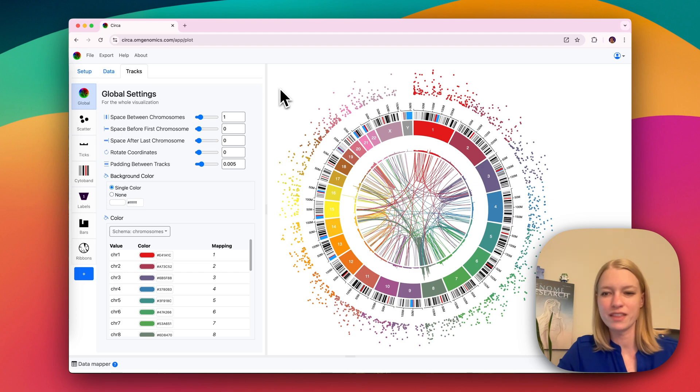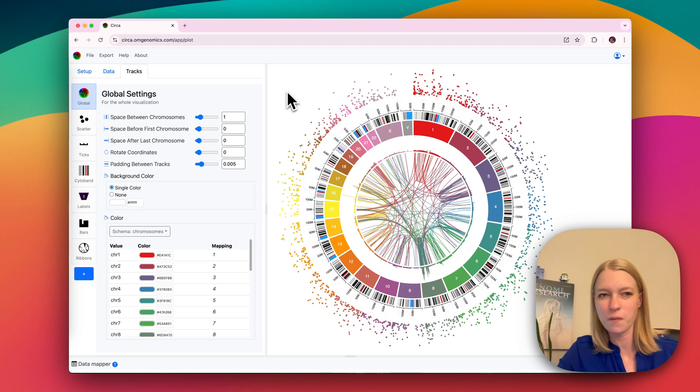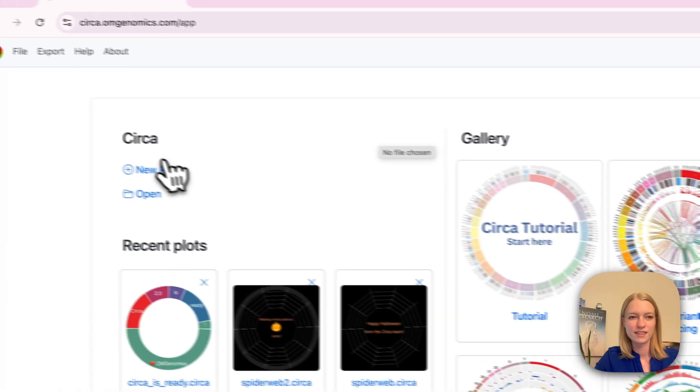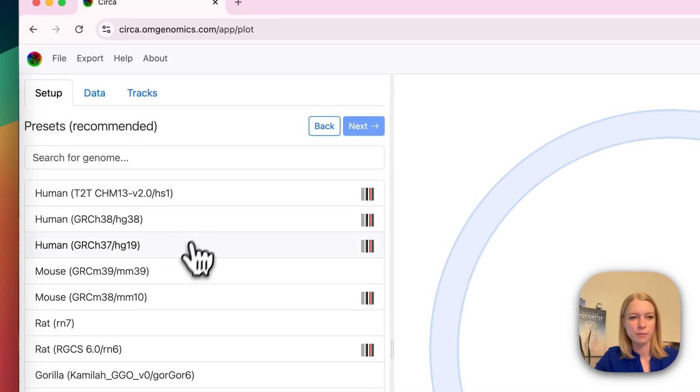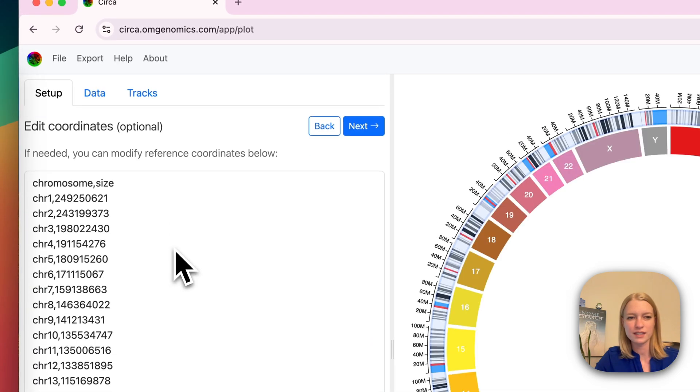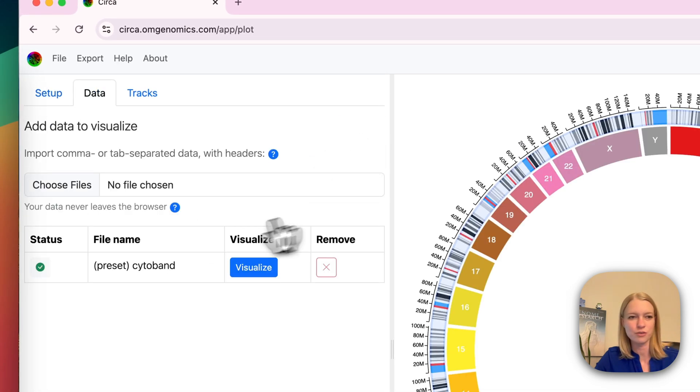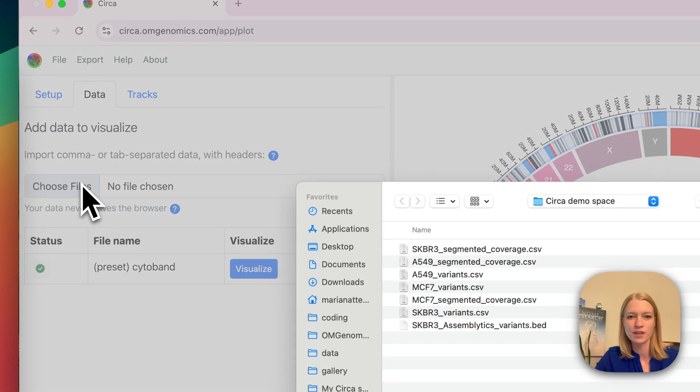All right, let's see if we can make this circles plot in one minute. We're going to pick a preset. This is HG19, a human genome.